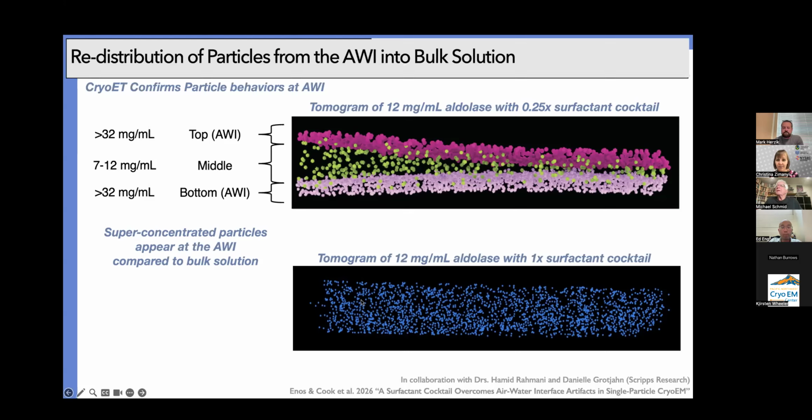Okay, I think you mentioned this in passing. Do you have any initial thoughts on surfactants with membrane proteins in nanodiscs, that people have tried with this but haven't had success with the ones we've tried? So the nanodisc versus micelle preservation of IMPs, I would say that is by far the first target that we're pursuing for integral membrane proteins, for the reasons you outlined.